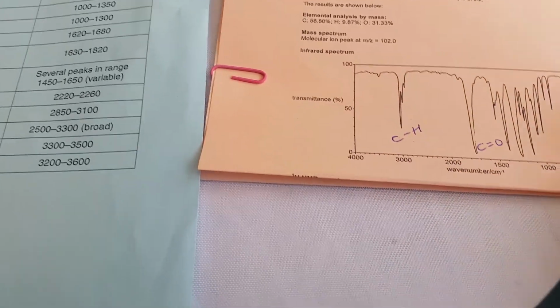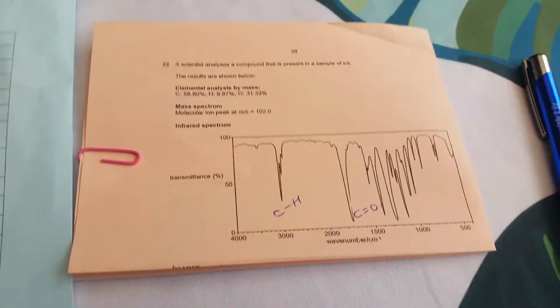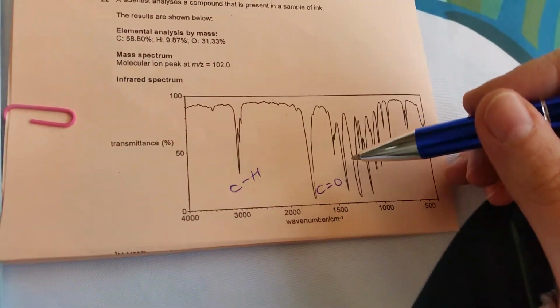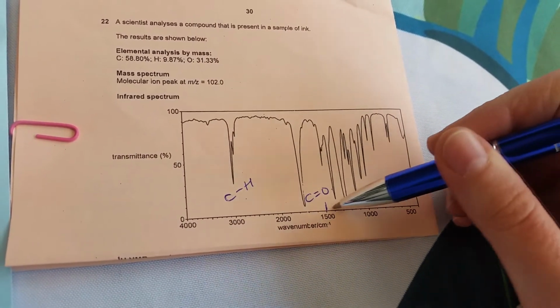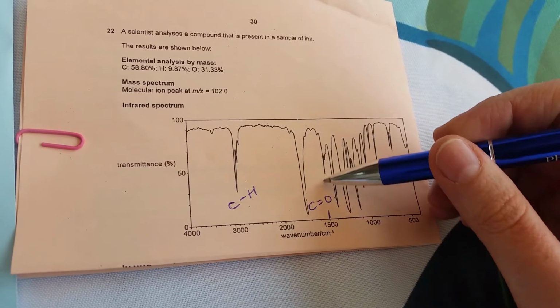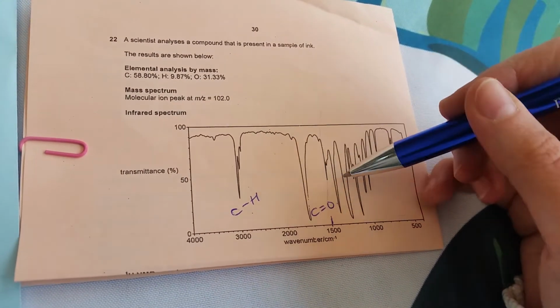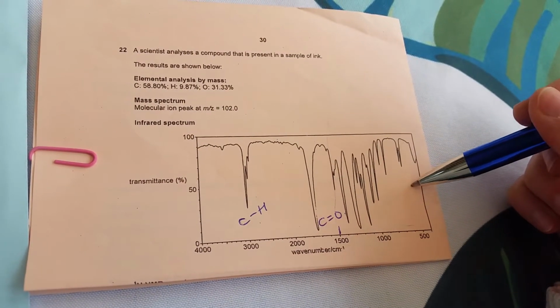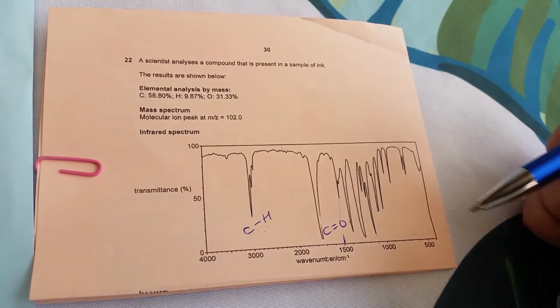CO. Now, one thing I haven't mentioned yet is that everything below 1500 is what's called the fingerprint region. This means that this region is characteristic of a specific molecule. So this pattern can be scanned by a computer and we can match it to a specific molecule by comparison.